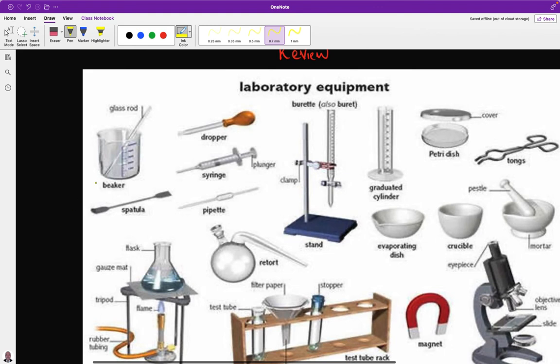The first one is a beaker. A beaker is used with a glass rod — the glass rod ensures that the solute dissolves in the solvent. We have a dropping pipette, used to take small volumes of liquid such as an indicator. We have the gas syringe for accurate measurement of gases. We also have the clamp and burette stand, used to hold the burette. We have the measuring cylinder, for quick measurement of volume.